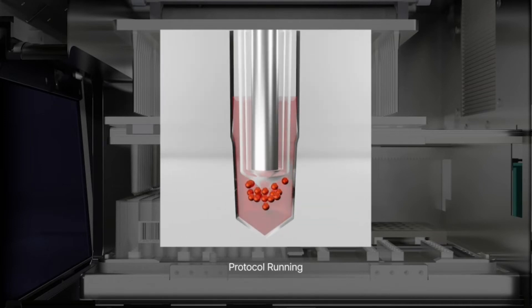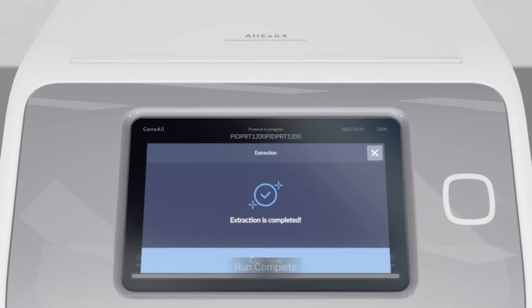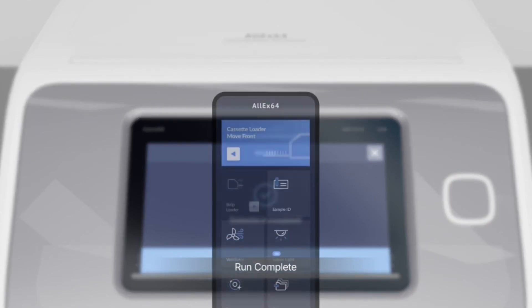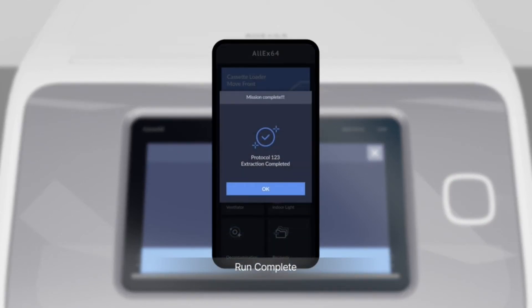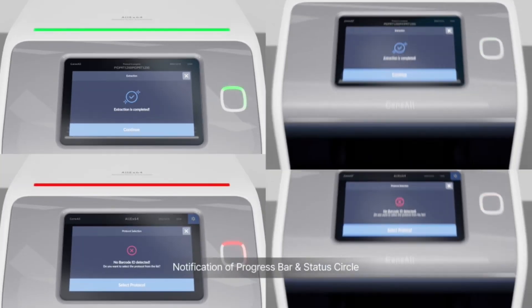Once the run is completed, it gives you notification on your phone. Full connectivity minimizes the time with the instrument and enhances remote working capability.